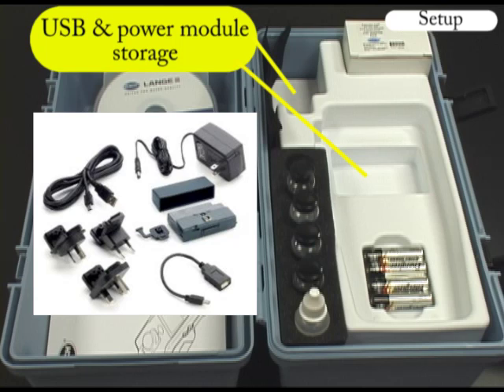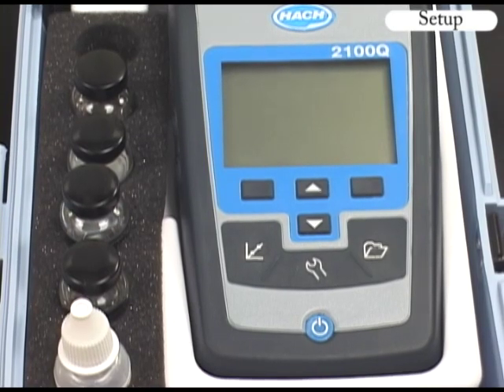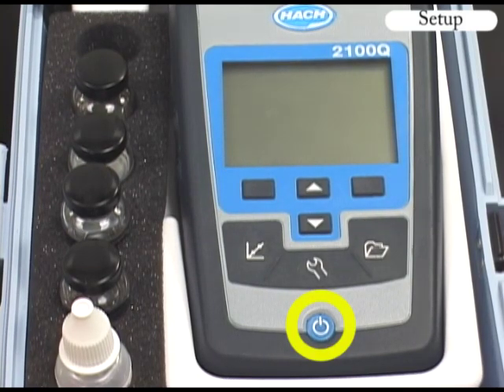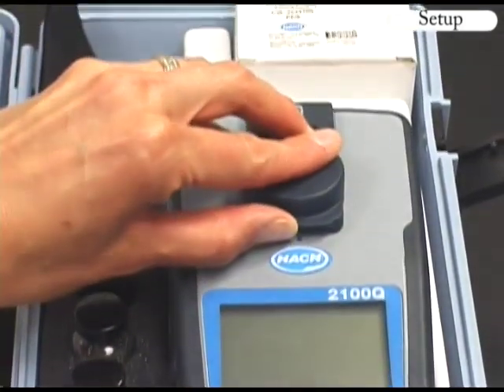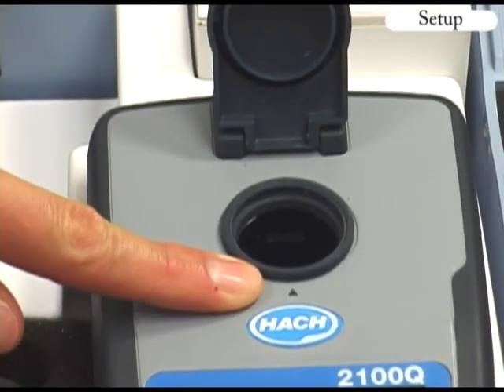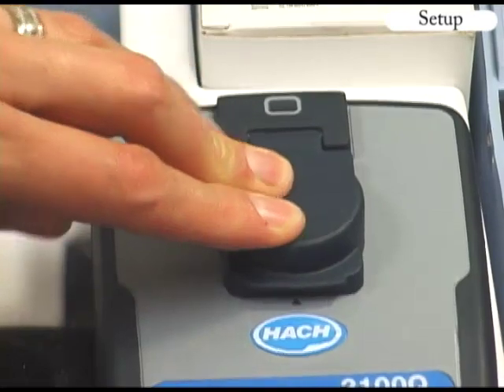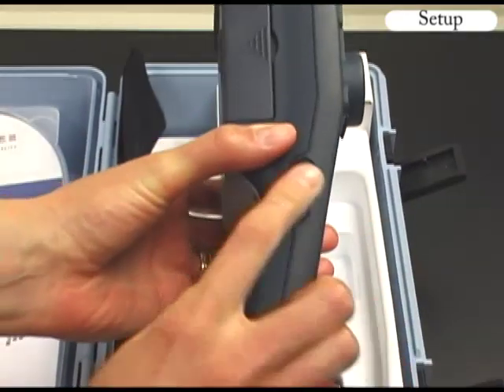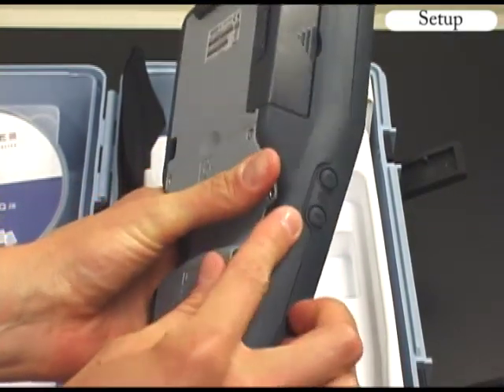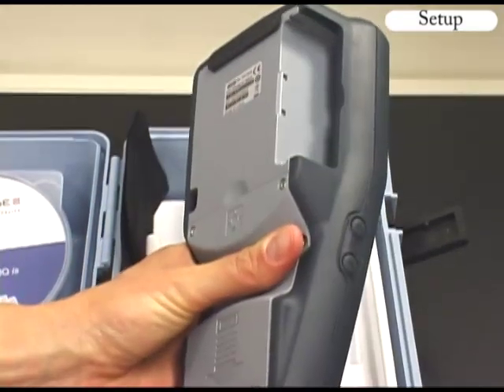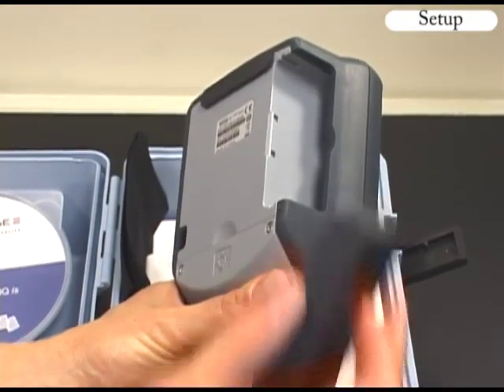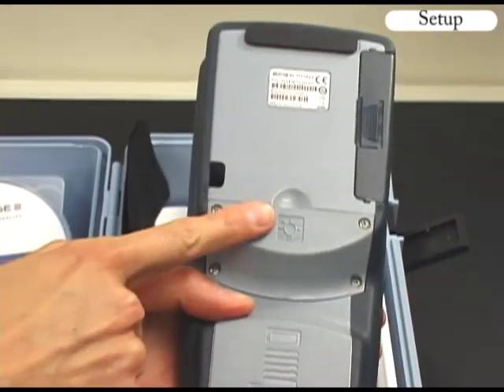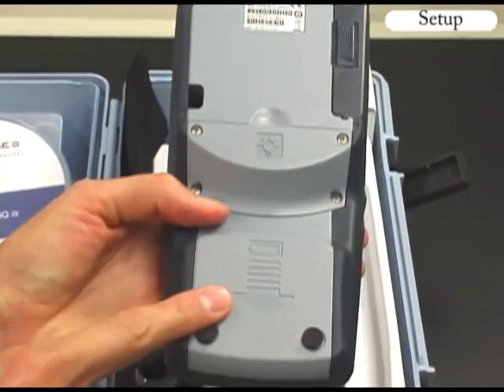There are also open positions inside the case to store the optional USB plus power module and its accessories. On the top of the instrument are the power button, sample cell holder and lid, alignment arrow for sample cell orientation, and attachment location for a lanyard. The backlight keys are located on the side of the instrument, along with the module compartment where the optional USB plus power module is installed. On the back of the instrument are the lamp compartment and the battery compartment.